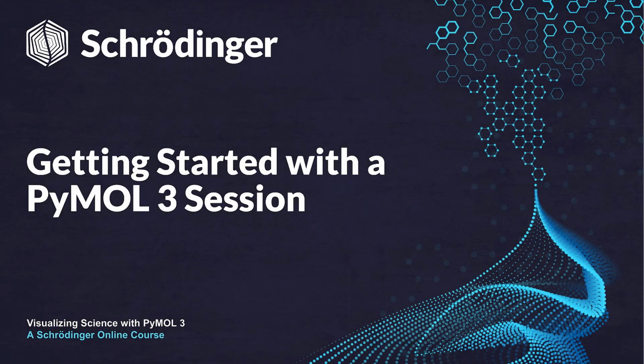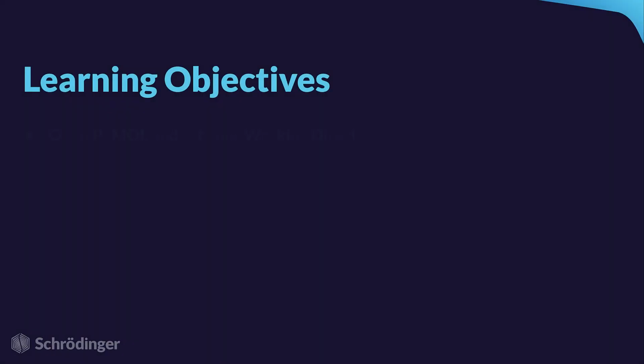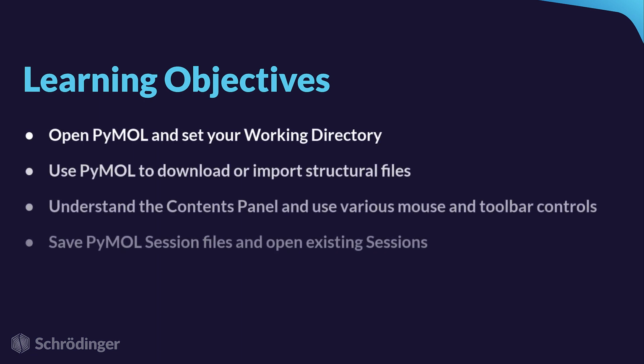Hello and welcome. In this video, we will be going over the basics of how to get started with PyMOL 3, creating, saving and opening PyMOL sessions, bringing in structures and exploring basic controls. By the end of this tutorial, you'll be able to open PyMOL and set your working directory, use PyMOL to download or import structural files, understand the contents panel and use various mouse and toolbar controls, and save PyMOL session files and open existing sessions.